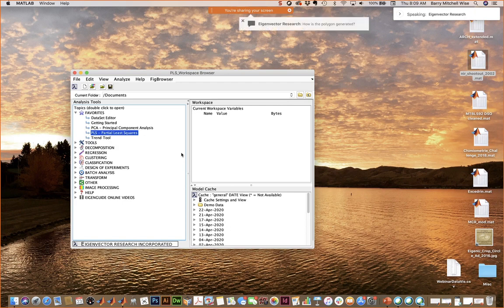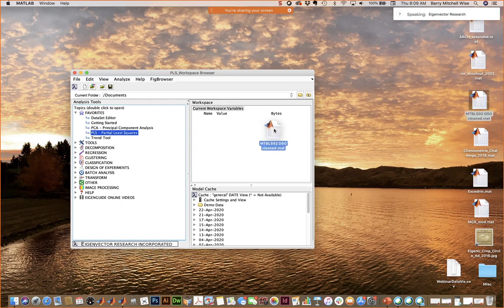I won't get into this now. There are all sorts of issues though with how you layer things, and we're going to do an example about that in a minute. I just wanted to show you one other quick thing here.